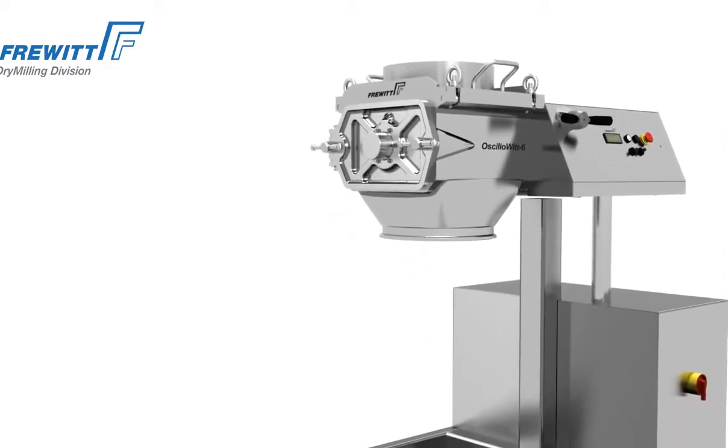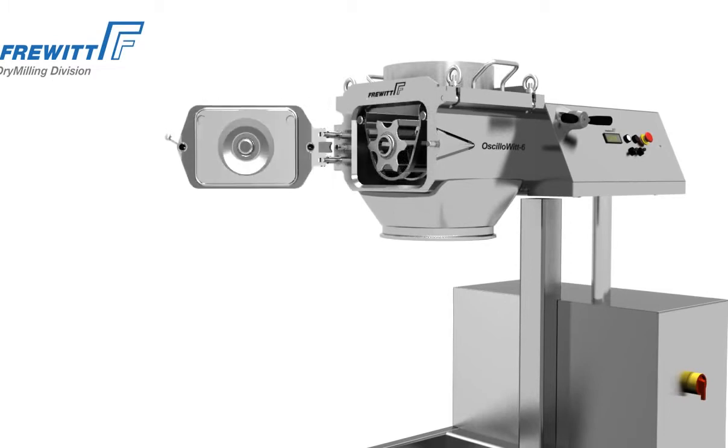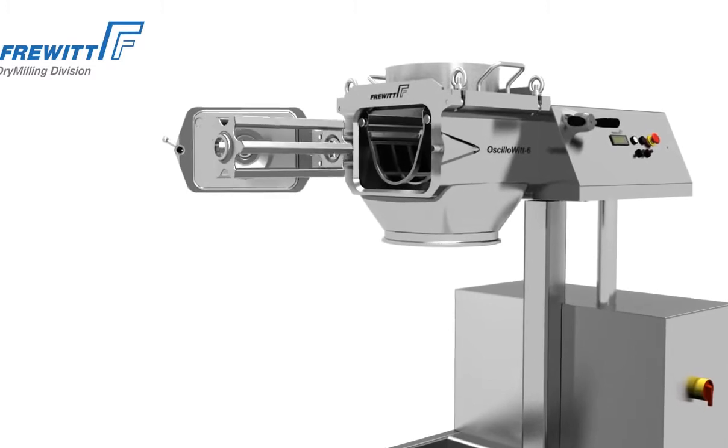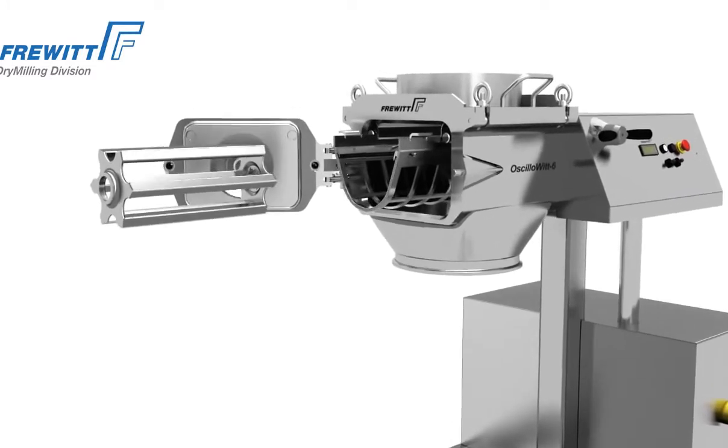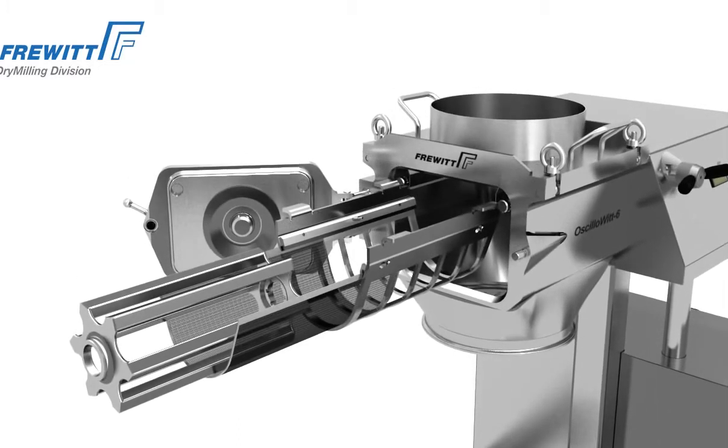With its large pivot-mounted front door, the Osillowit also sets new standards in terms of user and maintenance friendliness. For example, the rotor, sieve, and support assembly are easily dismantled and installed in just a few steps.